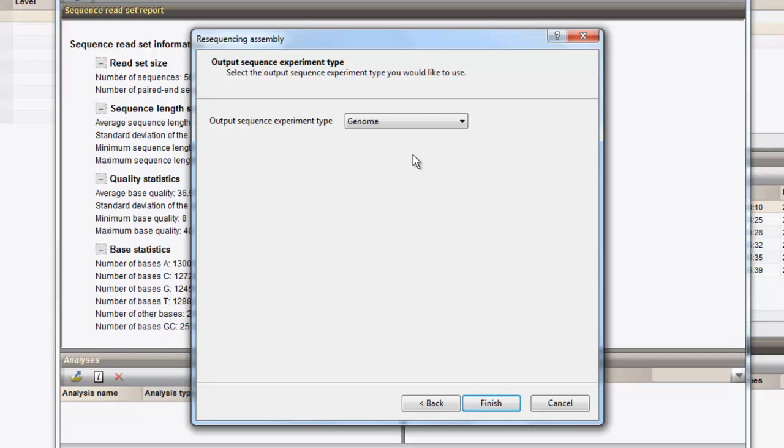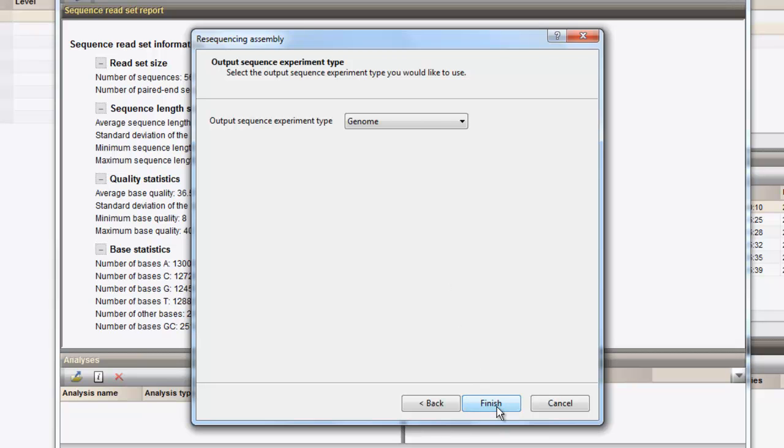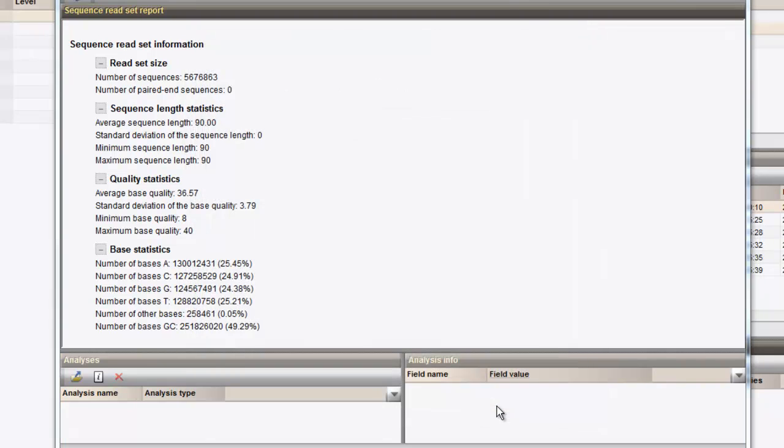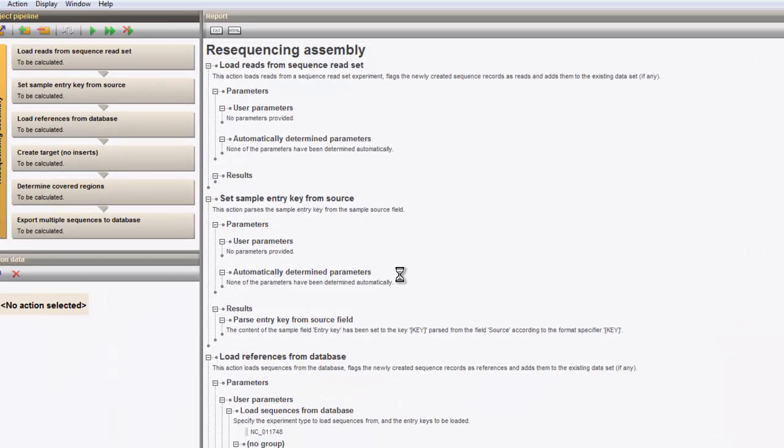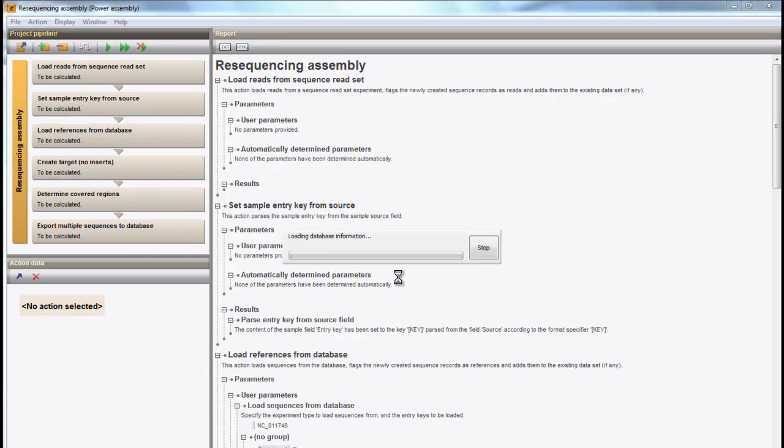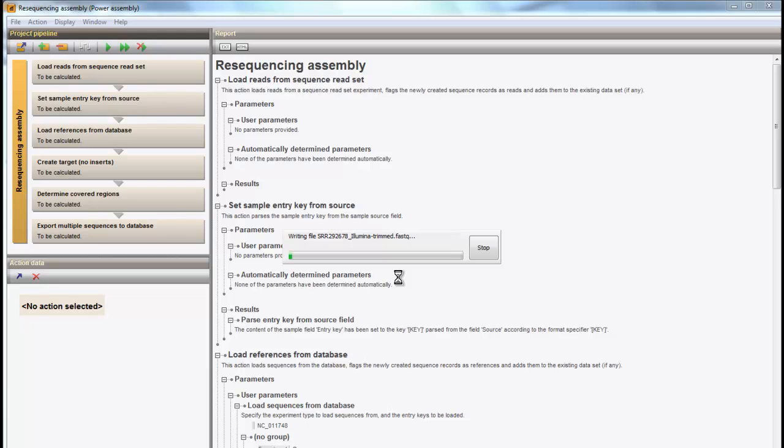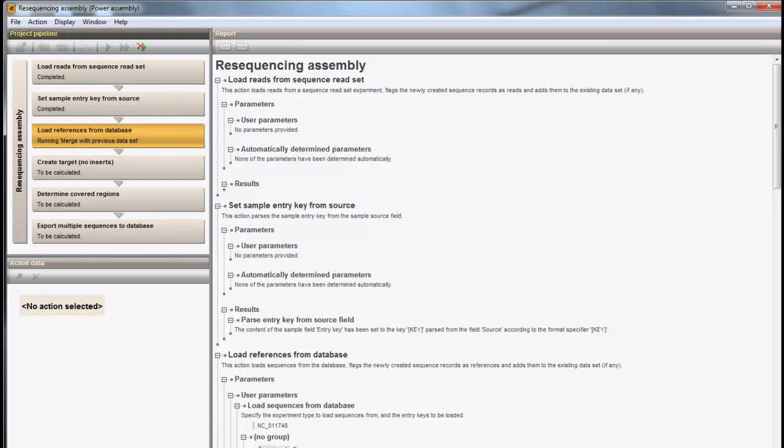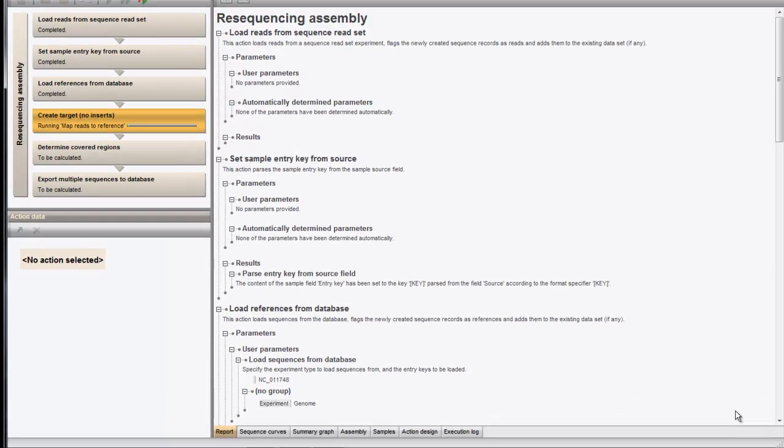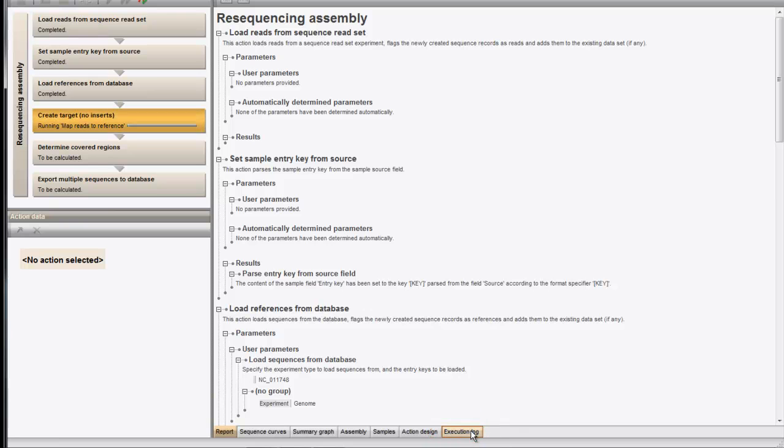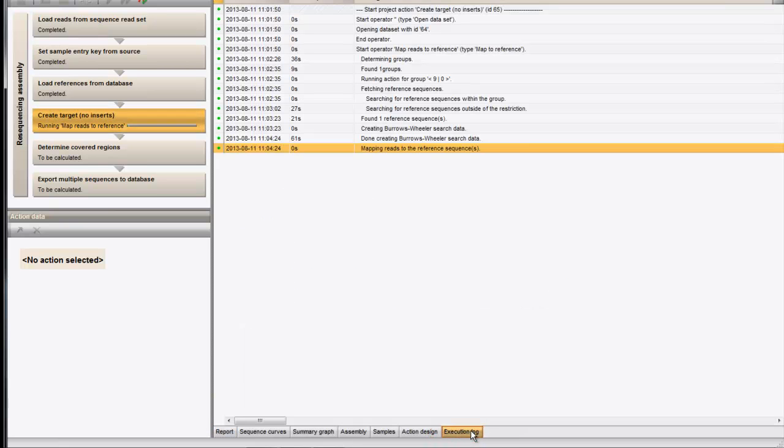After confirmation, the power assembly window pops up with the resequencing assembly pipeline in place and the calculation starts. In the tab Execution Log, you can view the current actions being performed.